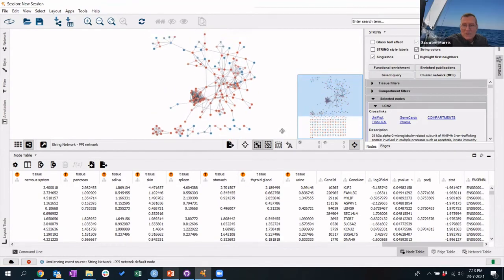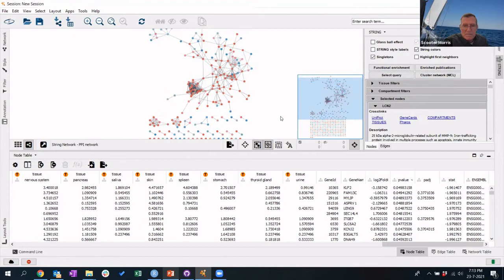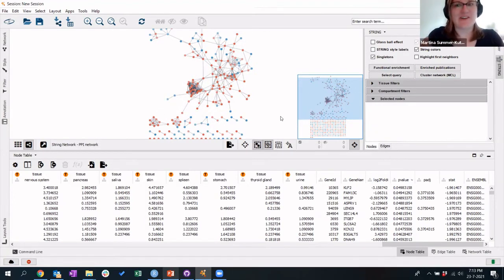So usually you could do this and then you would see the result and could make the thing. I needed to restart it now twice because it couldn't make the query. So I don't know what is going on. Maybe I made too many requests now. You can look at the errors, see the little error dialog. I will check that later on.